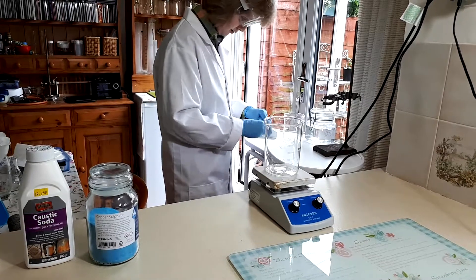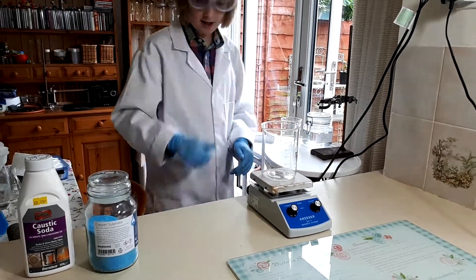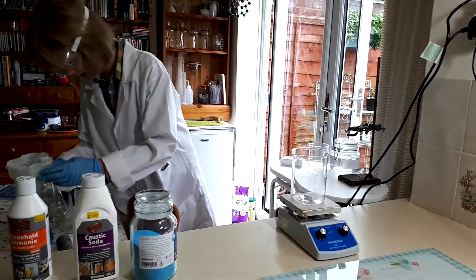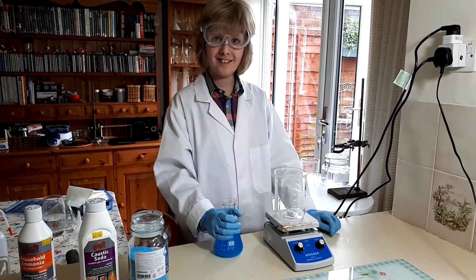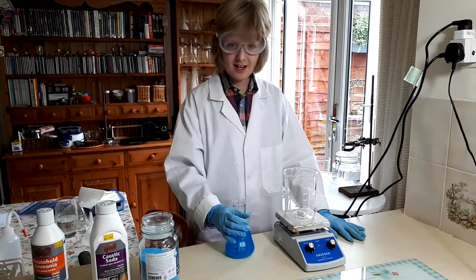We'll get out our beaker — this is finished filtering. So this is finished filtering.